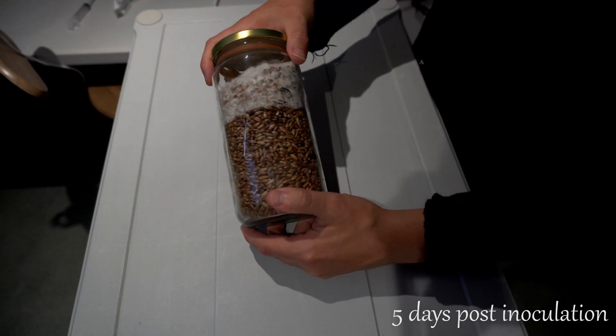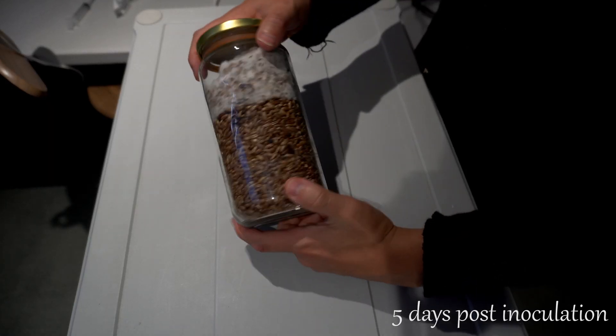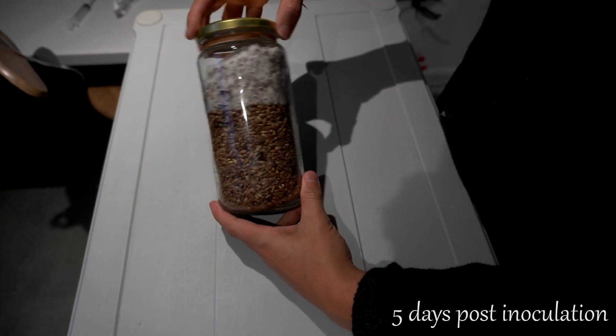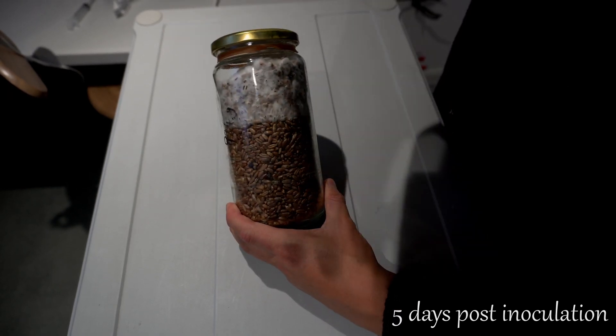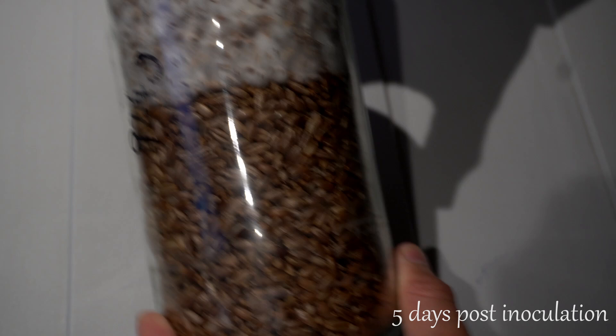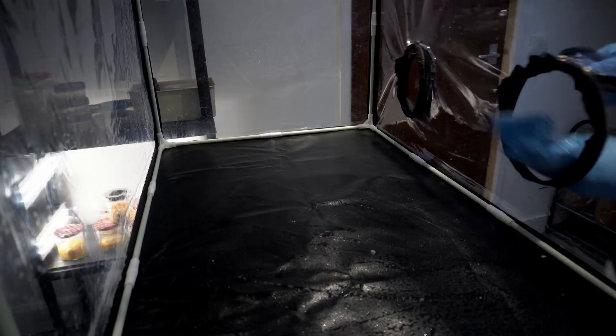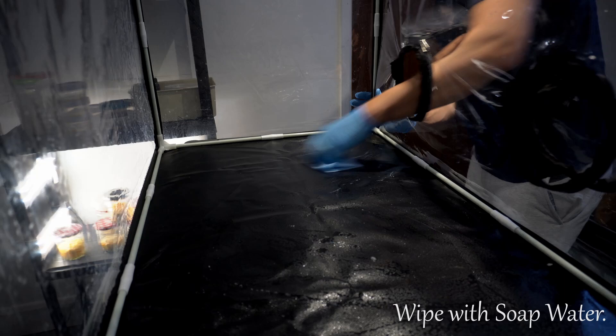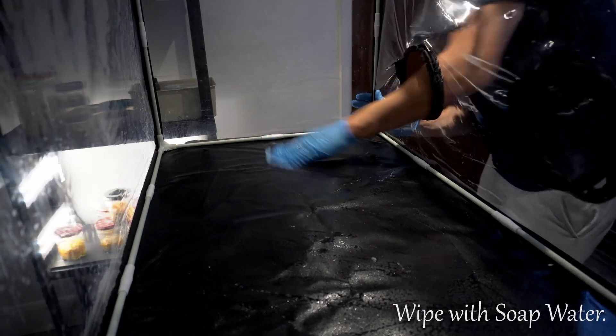In this video I'll be covering how to do grain to grain inoculation inside of a still air box. Grain to grain inoculation is probably the best way to expand spawn quickly and efficiently. By transferring colonized grain to sterile grains you can rapidly produce lots of mycelium for mushroom cultivation.